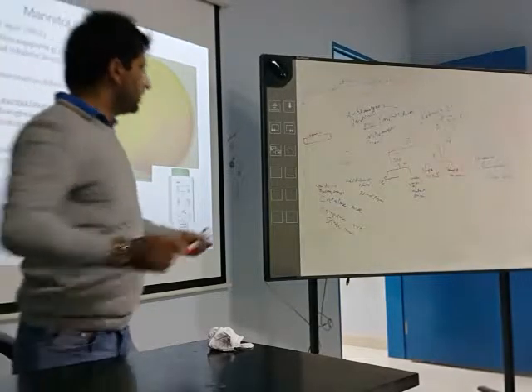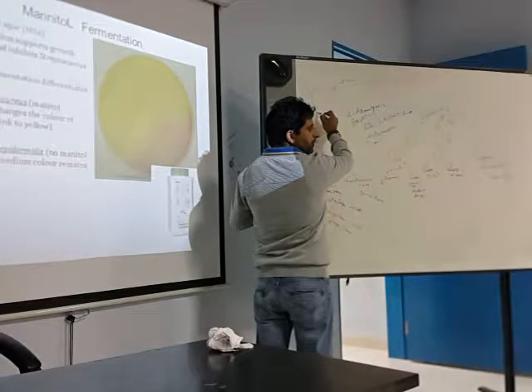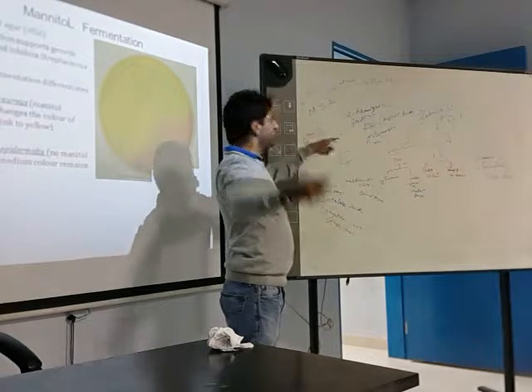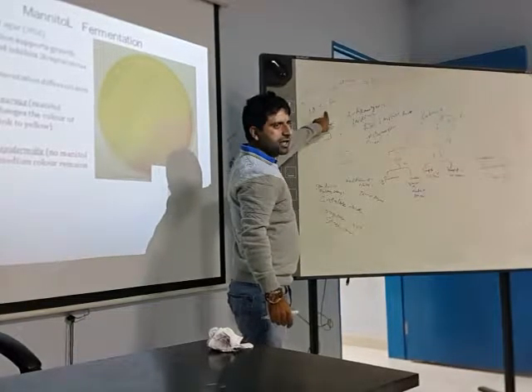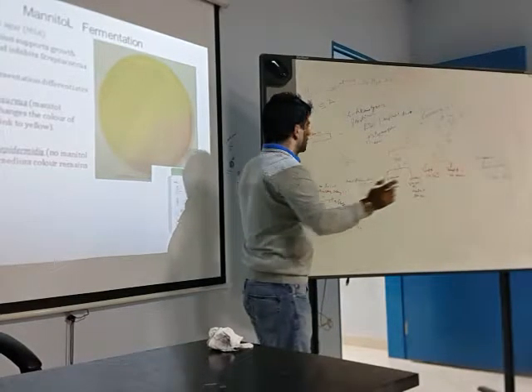This is one more test, called the mannitol salt agar. M stands for mannitol, which is a sugar, S for salt, A for agar. This is one more test where you can differentiate Staphylococcus aureus and epidermidis.